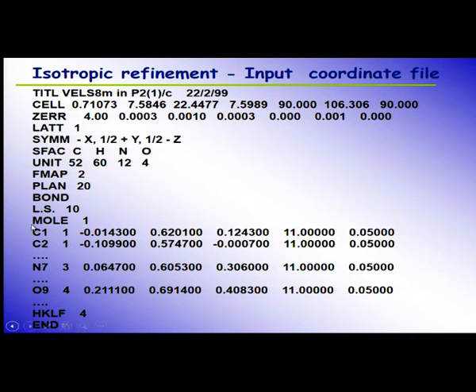Previously it was Q only, now the moment I put C it is 1, the moment I put N, nitrogen, it goes here, 1, 2, 3, nitrogen third species, it has put 3, you did not type anything. There is a connection between the graphical plot and the instruction file. Oxygen is the fourth species, 1, 2, 3, 4, this is okay.